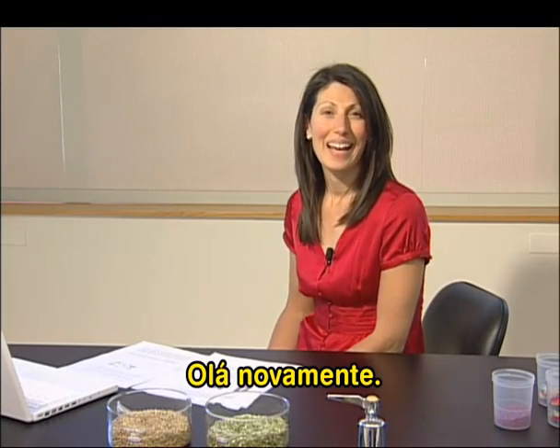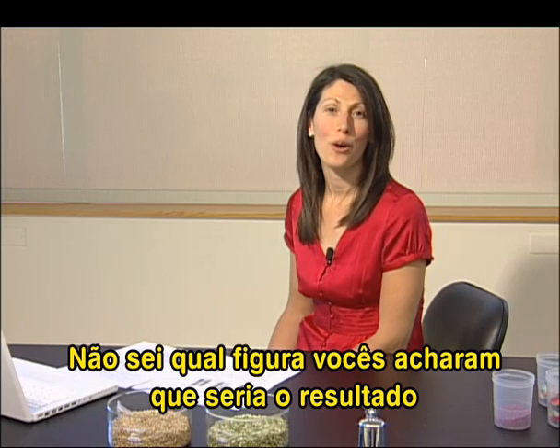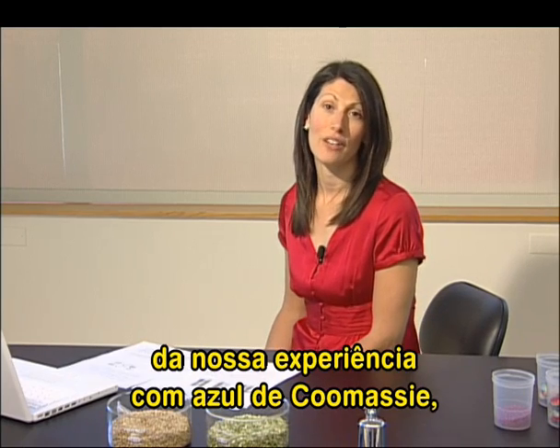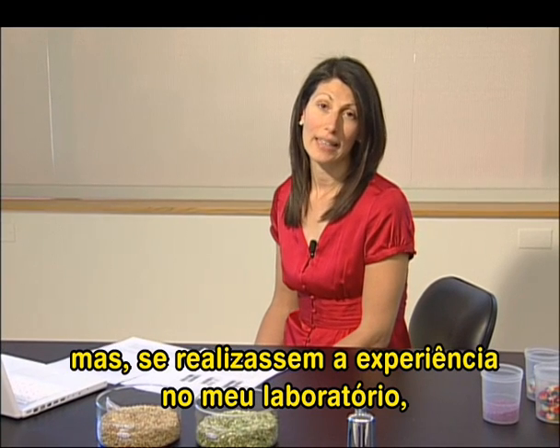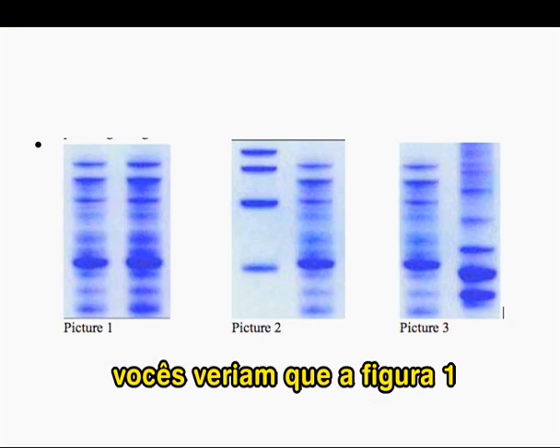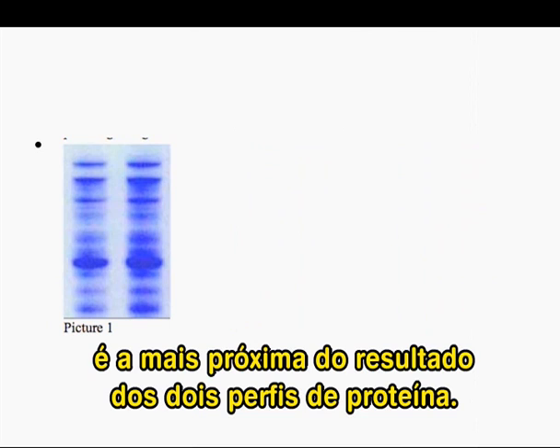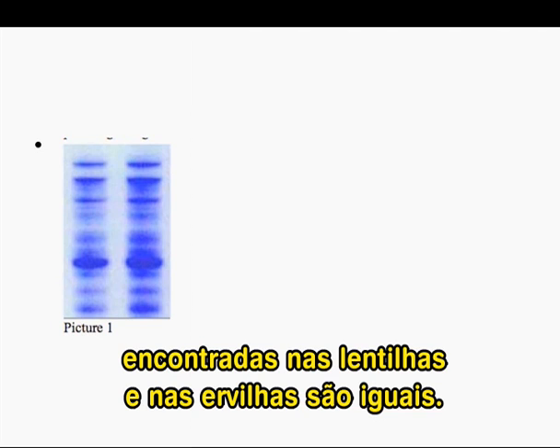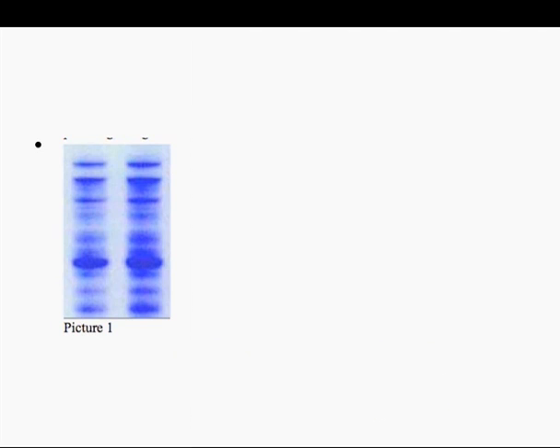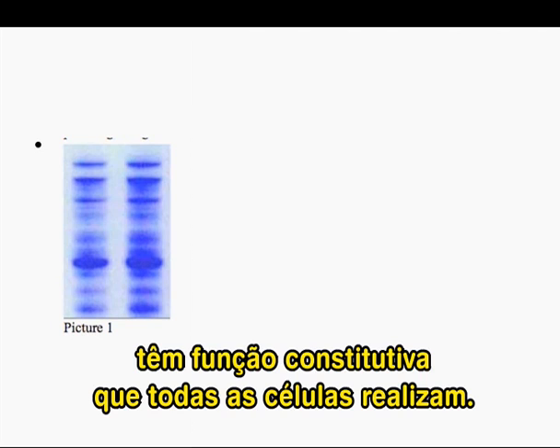Hello again. I don't know which of the pictures you thought was most likely to be the result of our Coomassie staining experiment, but in fact, if you were here in my lab and ran this experiment, you would see that picture 1 is closest to the result you would find for the 2 protein profiles. And that's because most of the proteins that are in the lentils and in the green peas are the same. Most proteins in the cell have housekeeping functions that all cells have to carry out.